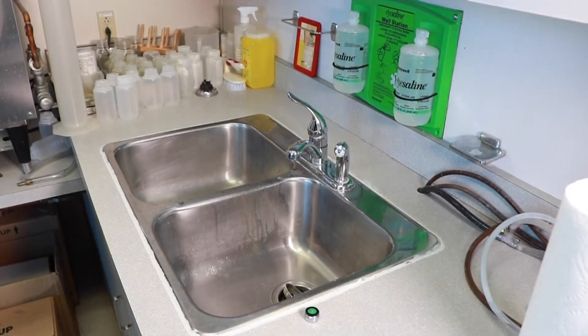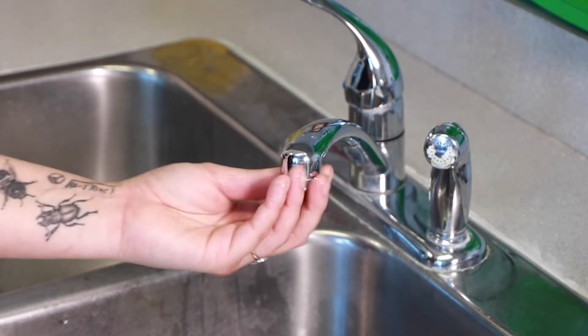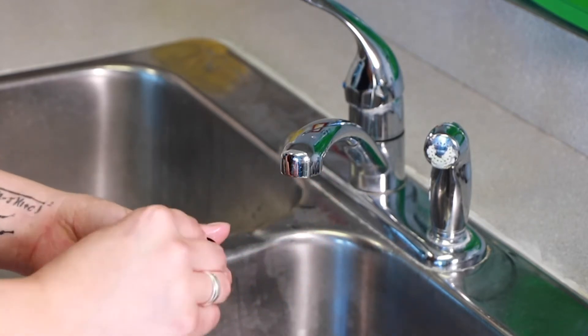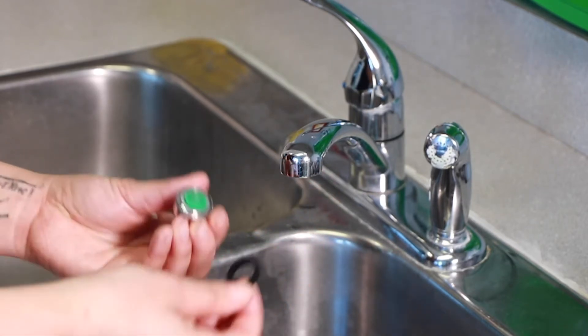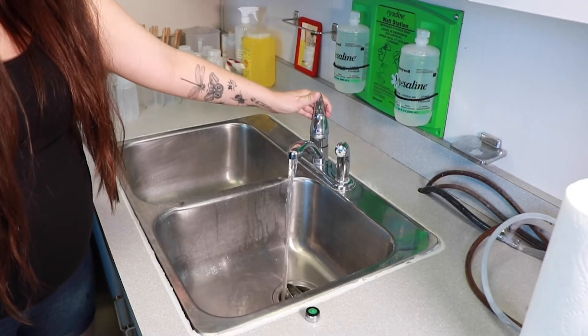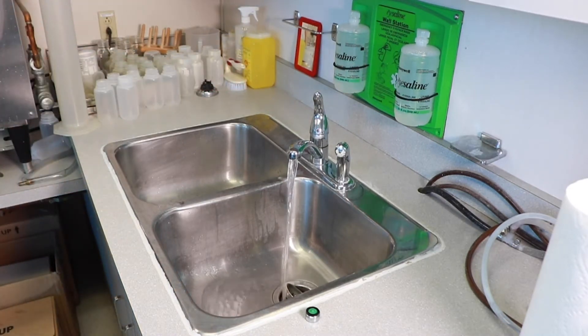This is how to sample. Check the tap and remove the aerator. Be sure the O-ring didn't get stuck inside the faucet — the O-ring needs to come out too. Turn the cold water tap on full and let it run for five minutes. This will help to ensure you get a representative sample.